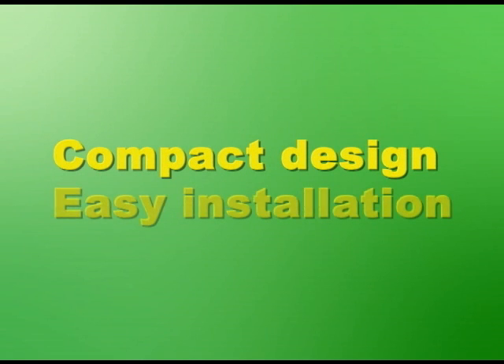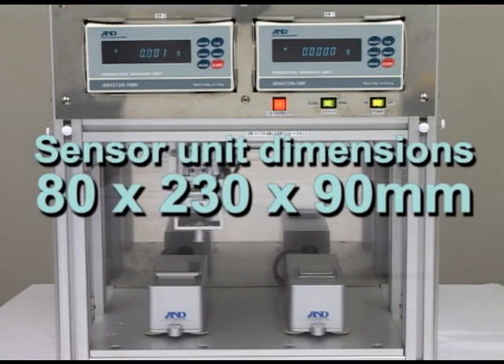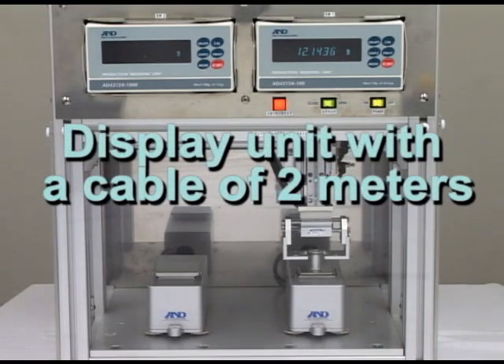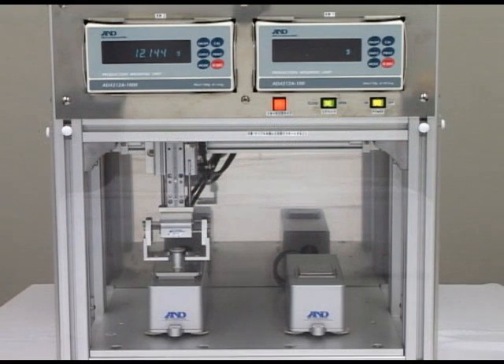The weighing sensor unit is also extremely compact, with dimensions of 80x230x90mm. It is connected to a display unit with a cable of 2m in length, and an optional 3m cable makes a maximum connection length of 5m possible for diverse weighing applications.